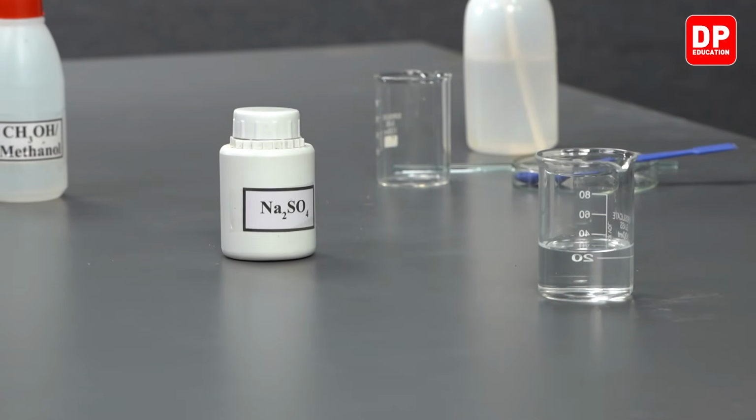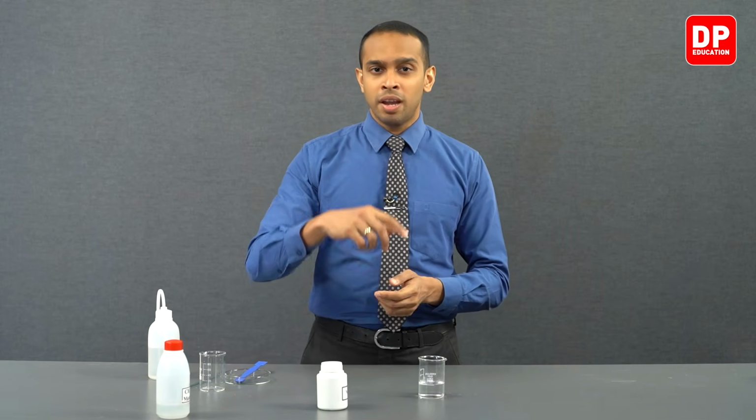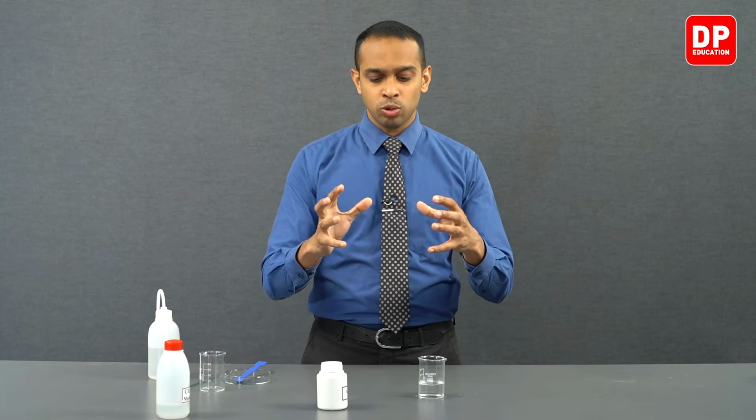And you will see in the presence of water how sodium sulfate will clump together as we add sodium sulfate to water and we start to mix it.